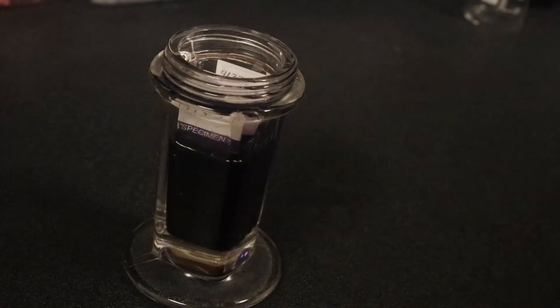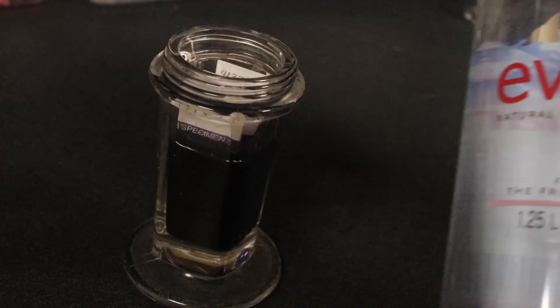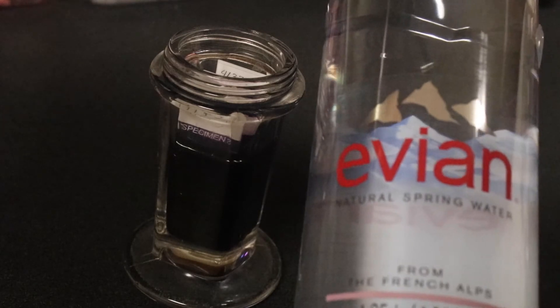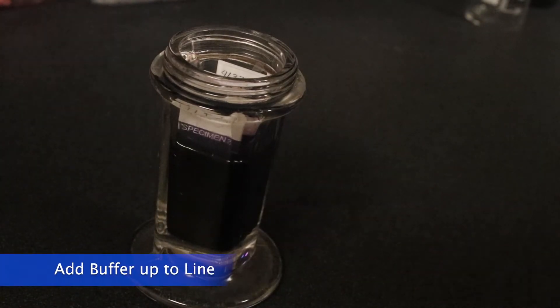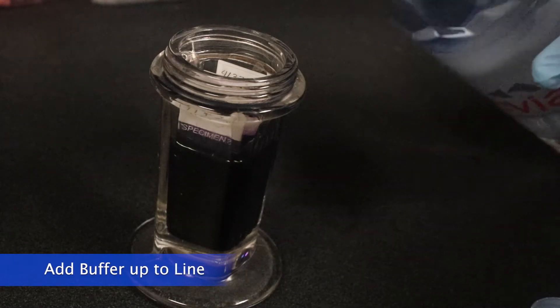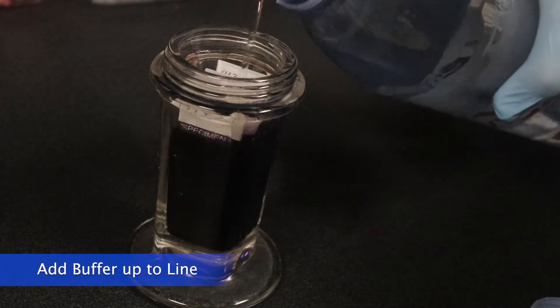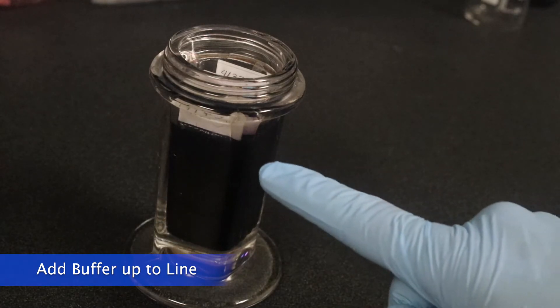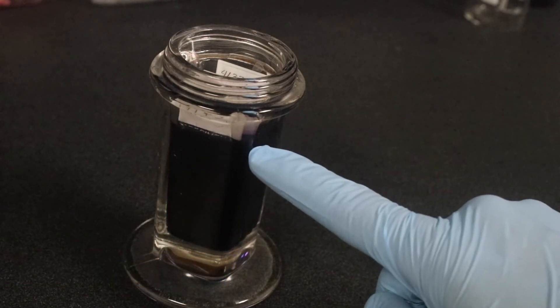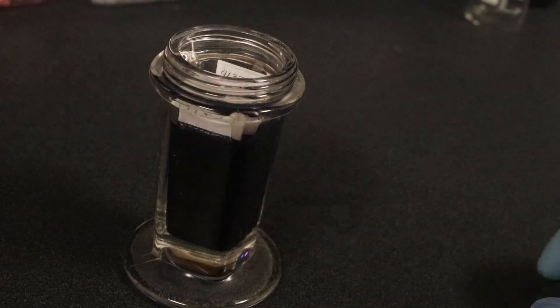Notice here that, like I said before, I undershot the amount of buffer that I wanted to put in, but now I'm going to add a little bit more so that the liquid level goes right up to the white part where you can write the numbers on, and that will stain the whole slide without staining the white area.